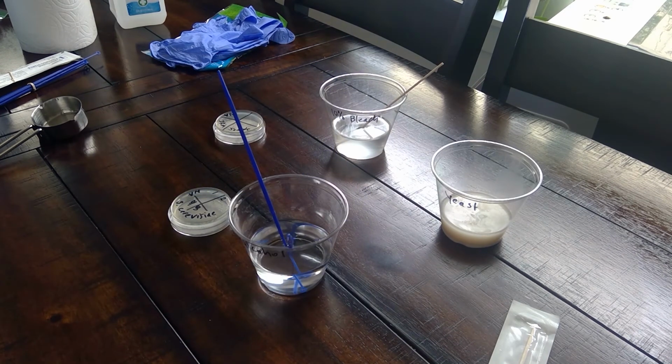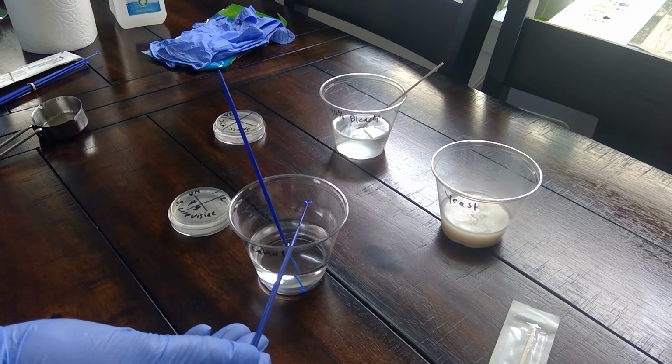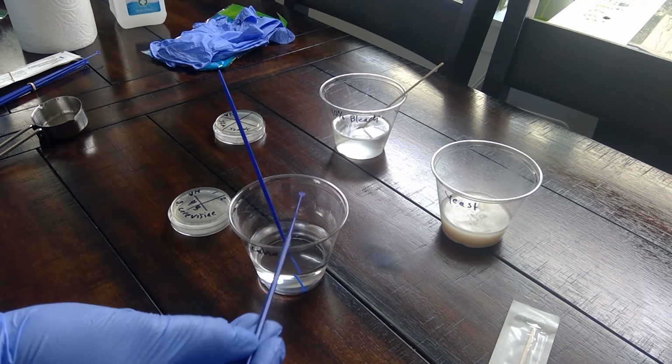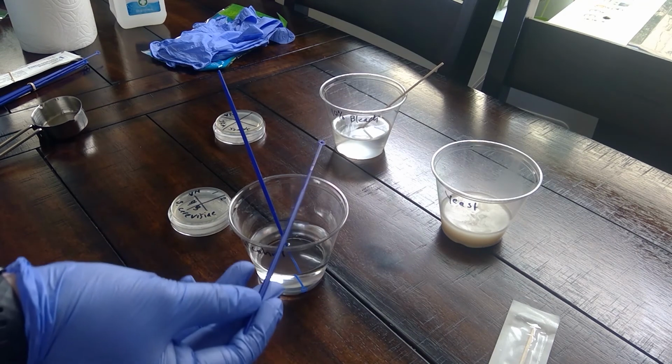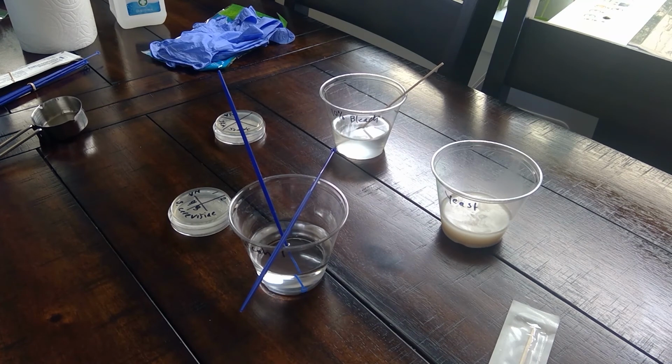So now we're at step 17. Return the lid to the agar plate. Put the inoculation loop into the cup of alcohol to sterilize it. After 20 seconds, remove the inoculation loop from the alcohol and shake briskly to air dry. So I'm just going to tap it, and then I'll let that air dry for a little bit.